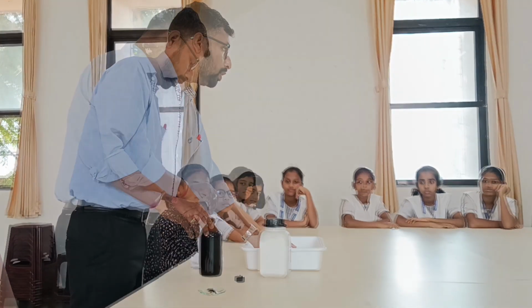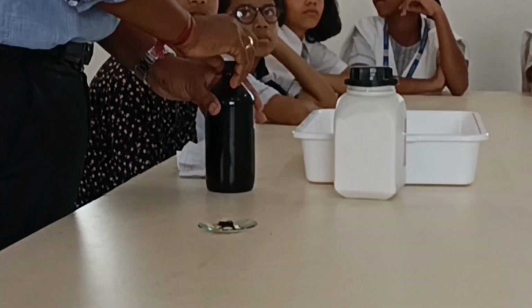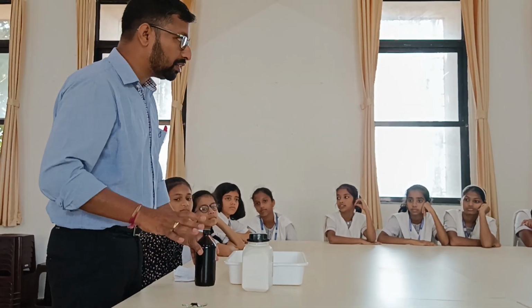Okay? So, most of the food materials that we have in our daily diet, for example, rice or roti or dosa, idli, all these food materials have starch in them. We knew this right from the beginning, but now we have tested it chemically and now we are sure. This is like a confirmatory test. Now we are confirmed that there is starch present in this.